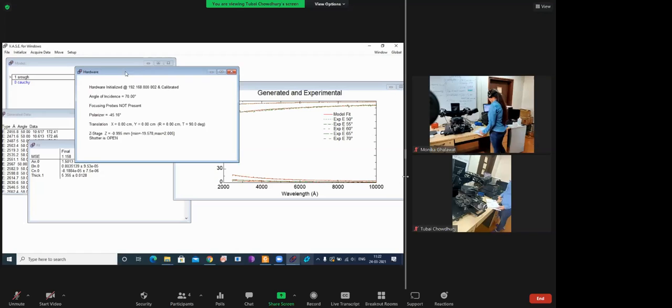I have not given them like this. In the Cauchy model, this equation is dependent on A, B, and C constants along with the wavelength. They are those parameters. I am not giving them. So for the model, what do they represent?